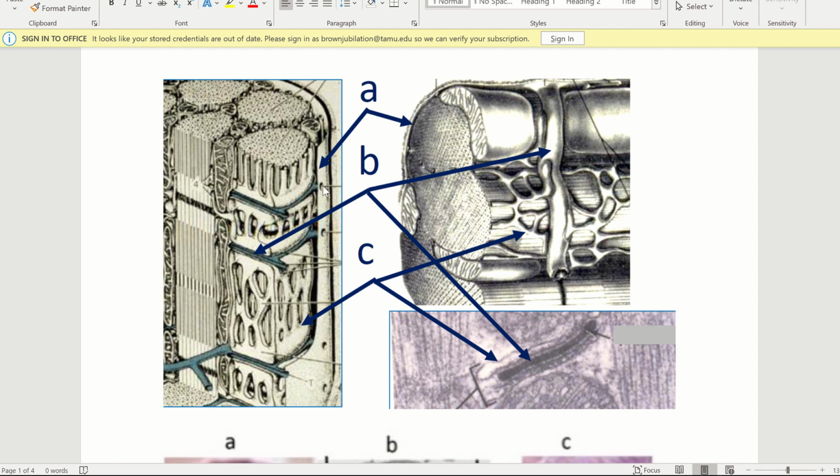So A, what this is pointing to is the outermost lining around this whole cell. This is one muscle cell, so this is that outermost lining, the cell membrane of a muscle cell. The special thing about the cell membrane of striated muscle cells is that it will actually dip down into the cell, and that's what forms that T-tubule that we've been talking about.